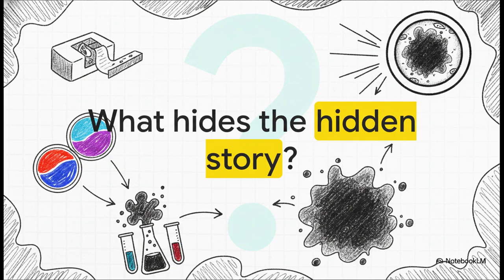You've prepared the perfect paper-thin tissue section. You've hit it with these brilliant special stains, and you find the microscopic details are completely obscured by a dark, ugly smudge. What chemical reaction causes this absolute diagnostic nightmare?